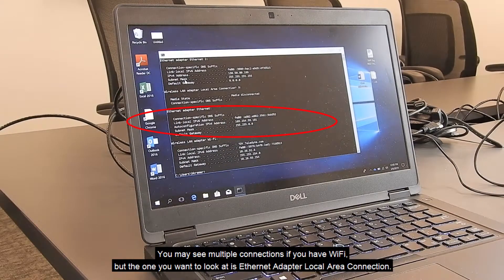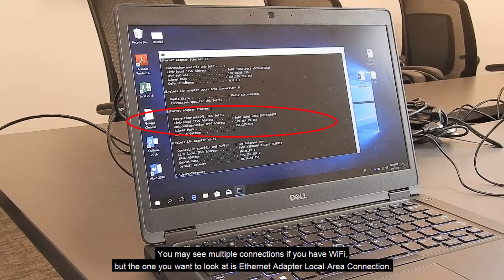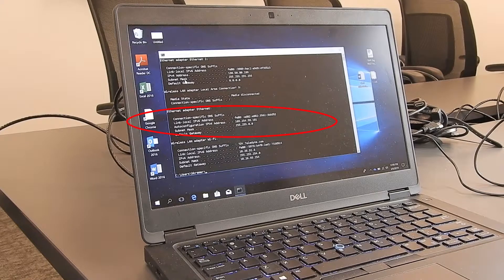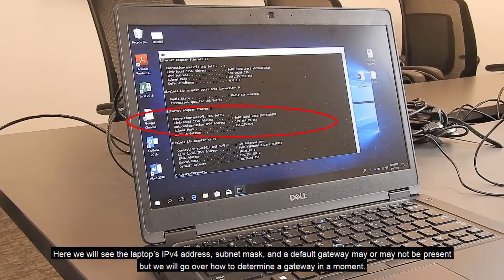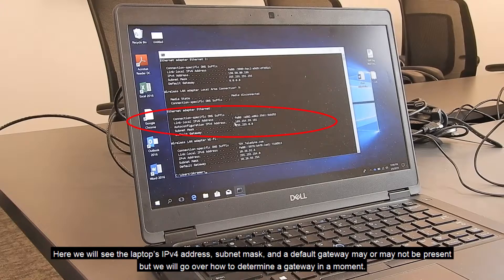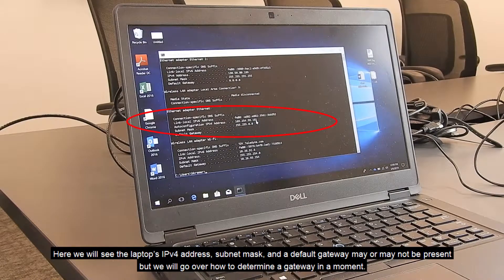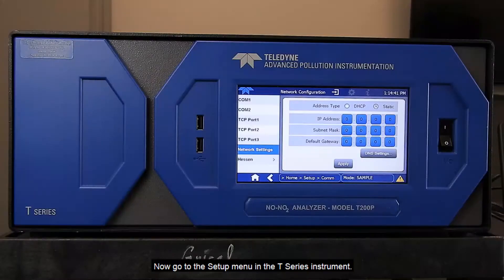You will see multiple connections if you have Wi-Fi, but the one you want to look at is the Ethernet adapter local area connection. Here we will see the laptop's IPv4 address, subnet mask, and a default gateway, which may or may not be present. We will go over how to determine a gateway in a moment.